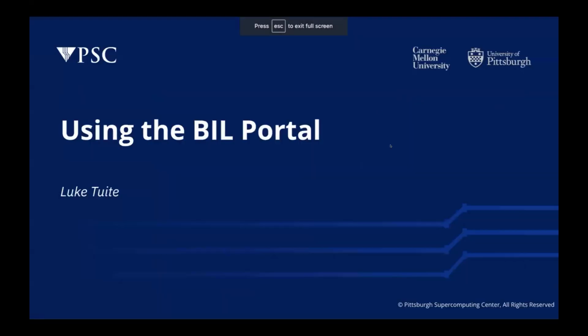Okay, hi everyone. My name's Luke. I'm a web developer at the PSC, and I also work closely with the curation team on data submission and the files that come into BIL, as well as handling user tickets and issues that users may have. Today, I'm going to talk about the submission process itself, on how to create a submission at BIL and get the files over here and everything you need to do to get that data public.